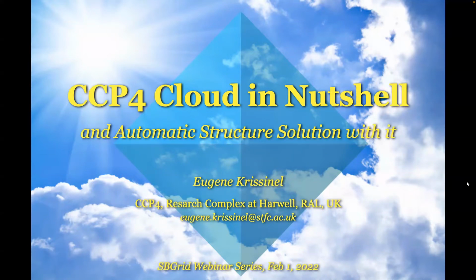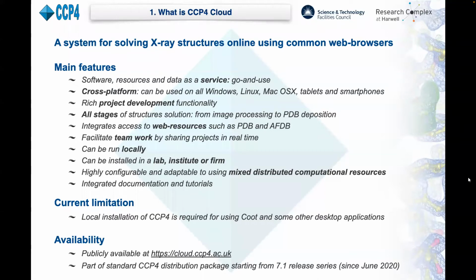Oh, thank you very much for the introduction and good afternoon, everybody. Good evening to myself, I'm in the UK. Many thanks, SBGrid, for the invitation to give this webinar. It is a real pleasure to have this opportunity to present the latest development in Collaborative Computational Project Number 4 in protein crystallography, also known as CCP4. Today, I'm going to give a brief overview of CCP4 Cloud and its use for automated structure solution.